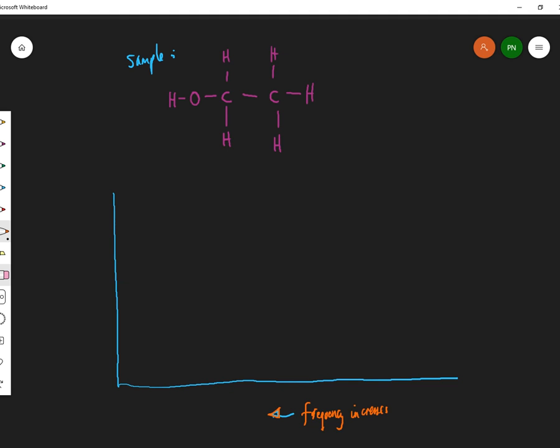So this is a throwback to the old days when the paper moved and the pen stayed in the same place. The paper moved from right to left, and as the paper moved, the recordings came.